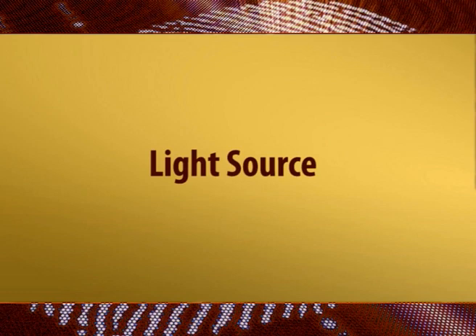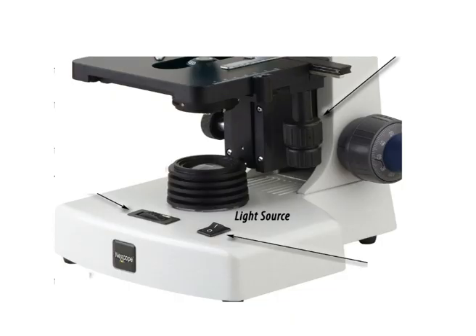Now, the different light sources. Various sources of light can be used. At its simplest, daylight is directed via a mirror. Most microscopes nevertheless have their own manageable source of light, generally a halogen lamp.